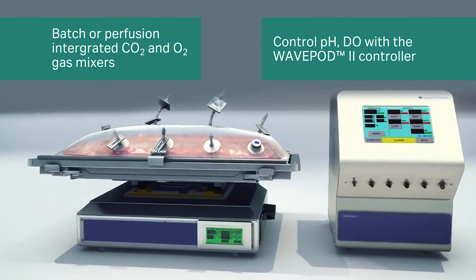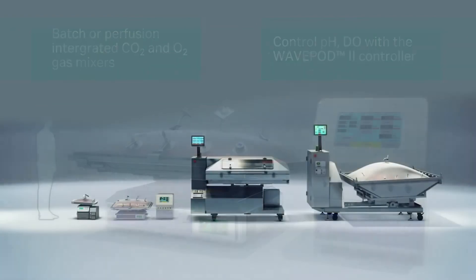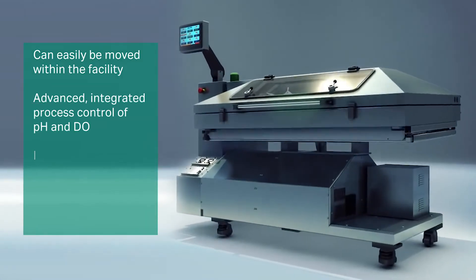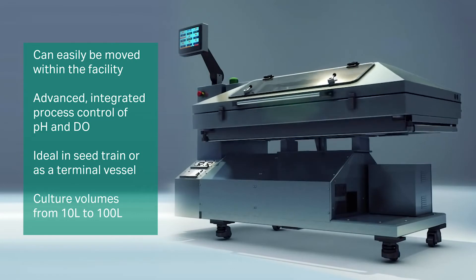The Wave Pod 2 controller can be used for advanced process control and monitoring of pH and dissolved oxygen. The System 200 can handle culture volumes up to 100 liters. It provides an ideal platform for the seed train of approved biologics or as a terminal vessel.